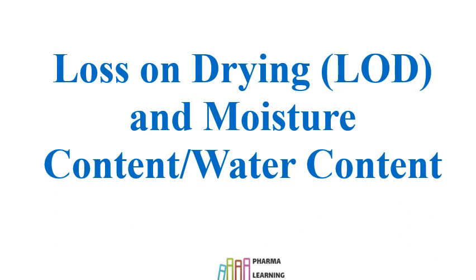Welcome to the video on loss on drying, that is LOD, and moisture content or water content. All these terminologies are considered similar by many professionals, but there are differences between these two. LOD is different, and water content or moisture content is different. Both are used for APIs, excipients, and also for finished products.